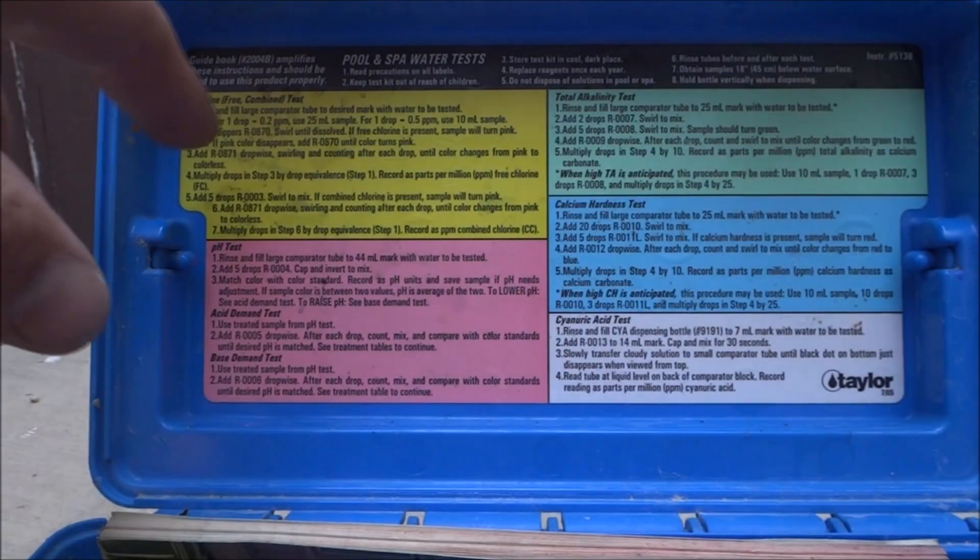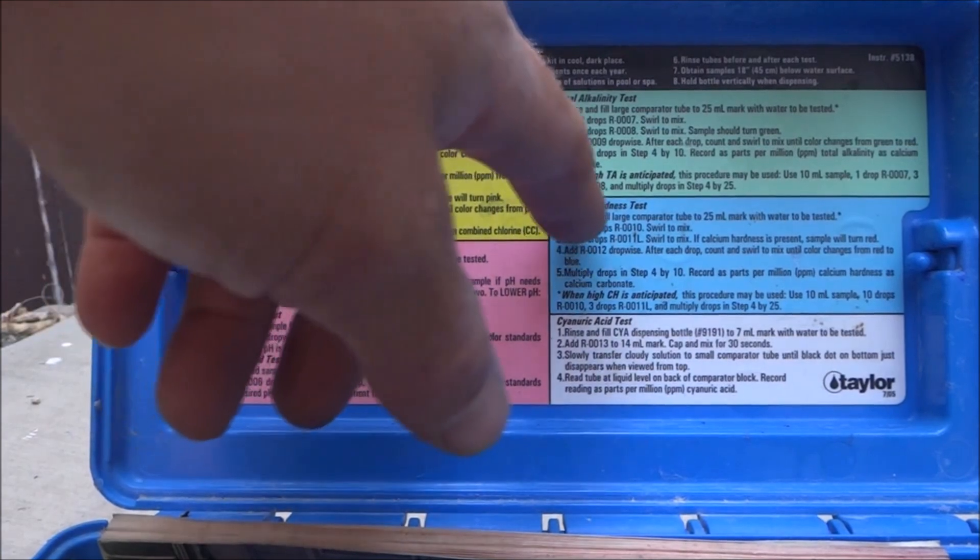This can be used for any test that requires a swirl, which would be the chlorine, total alkalinity, and calcium hardness.